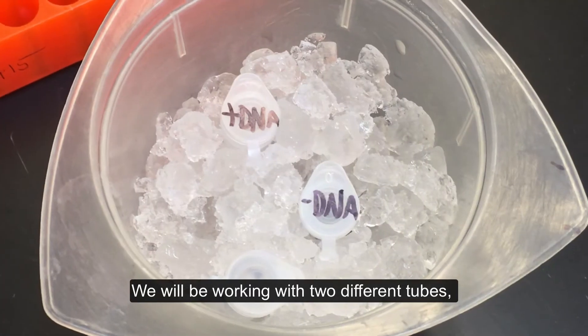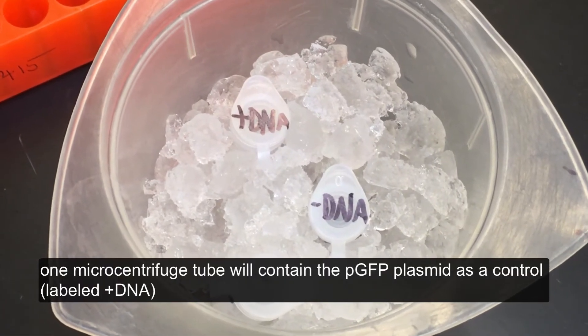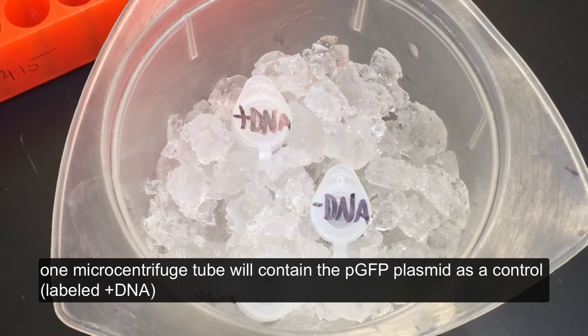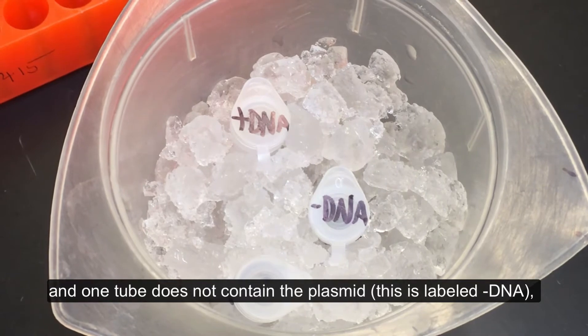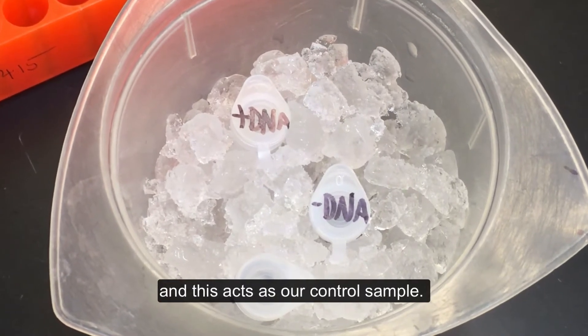We will be working with two different tubes. One microcentrifuge tube will contain the PGFP plasmid as a control, labeled plus DNA, and one tube does not contain the plasmid. This is labeled minus DNA, and this acts as our control sample.